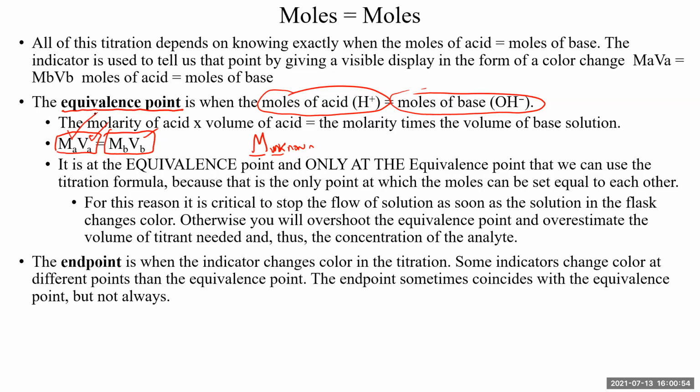The point of the titration experiment is actually to tell you this piece of information: how many milliliters, or what volume, of your known concentration solution was required to completely neutralize your unknown solution?